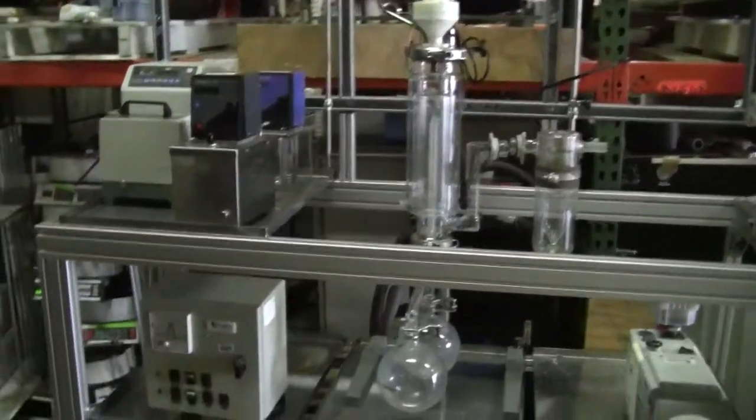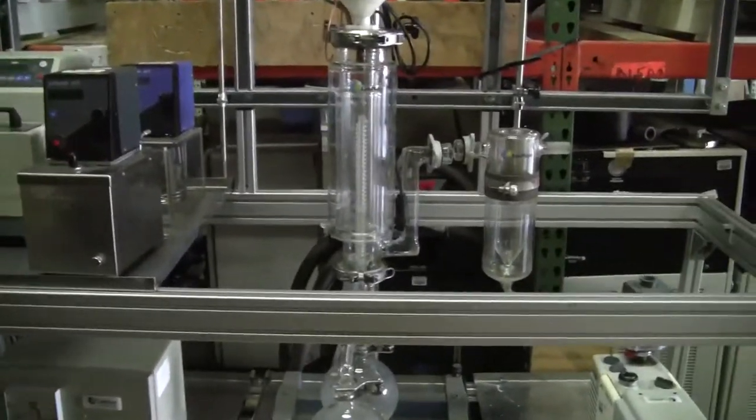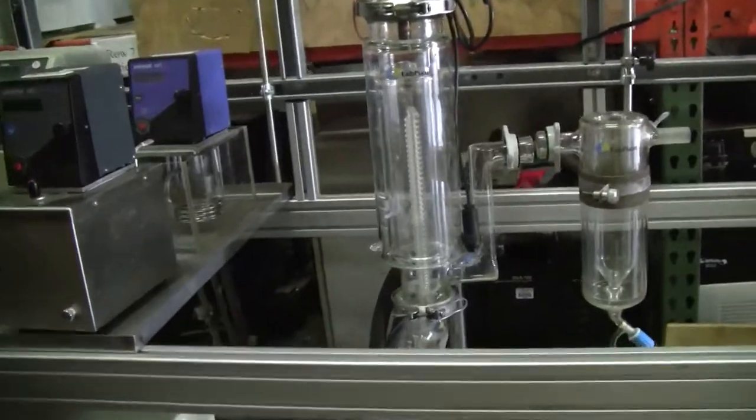Hi, this is Michael from Hitech Trader. Today we're looking at a thin film evaporator. It's a wipe evaporator.